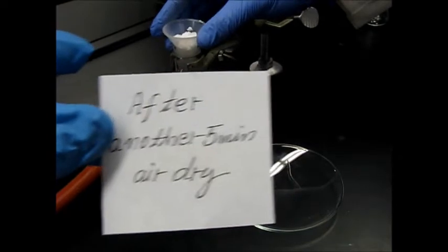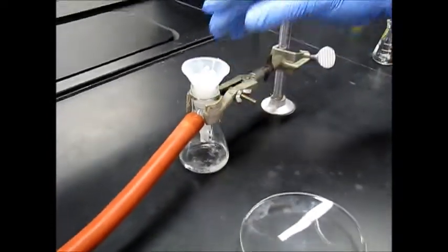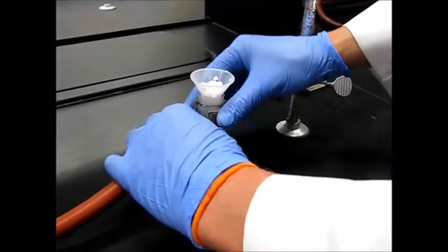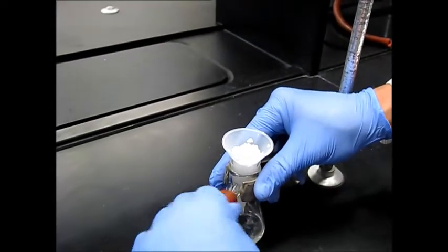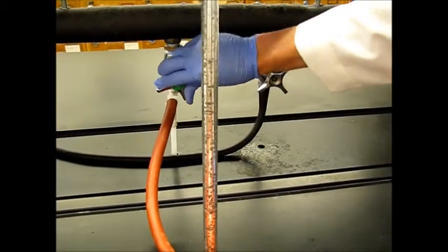So we've let it air dry for another 5 minutes. So we're going to go ahead and take it off the vacuum. Whenever you take something out of a vacuum filtration apparatus, first you remove the vacuum hose. Then you turn off the vacuum. Okay, in that order.